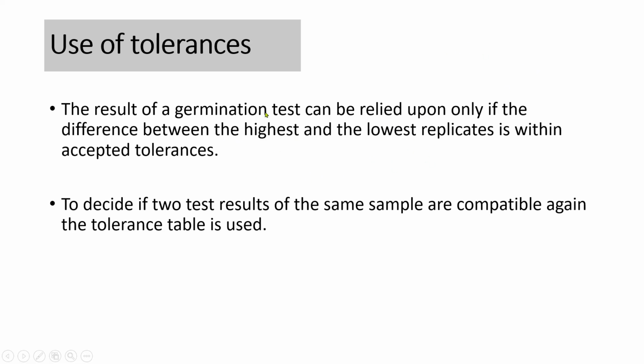Although a difference can be there, that's why replication is done, the difference should not be in that range, and that range is called tolerance. If it surpasses the tolerance, we have to repeat the test.